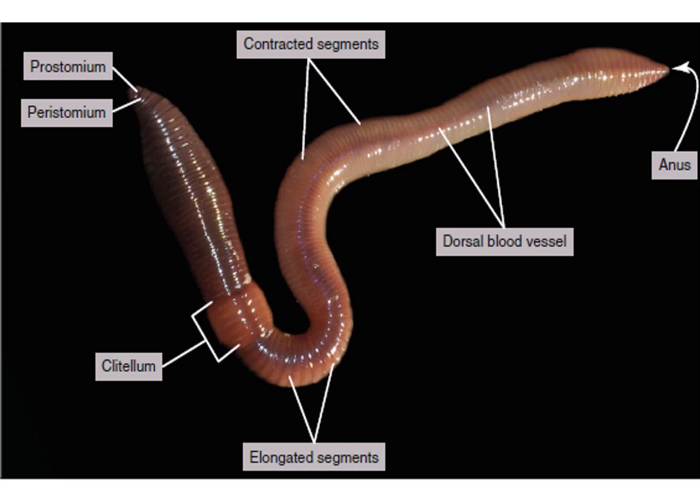or a magnifying glass. First we have to identify the dorsal side and the ventral side of the earthworm. The dorsal side is a bit rounder, and it is darker as compared to the ventral side.